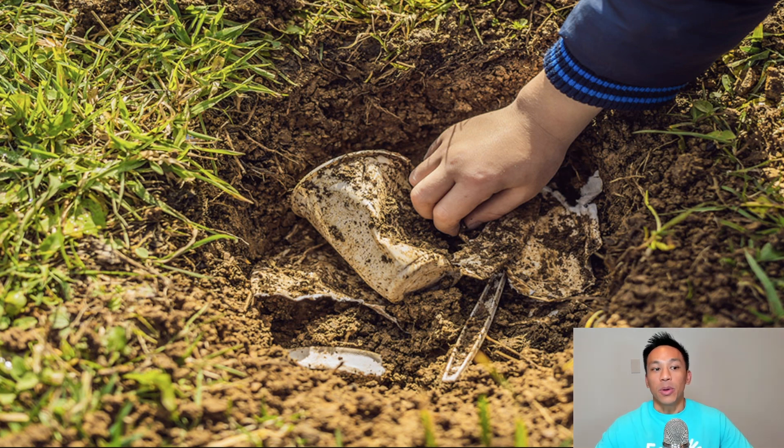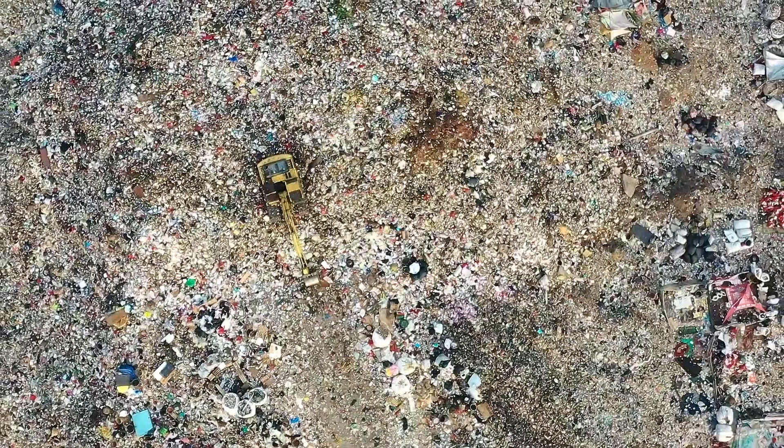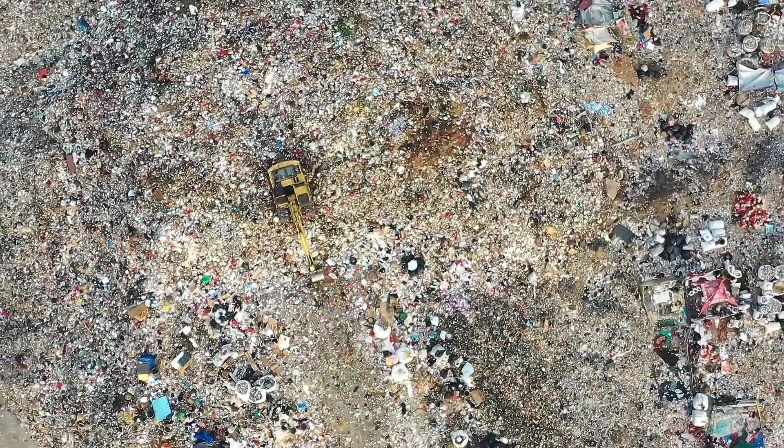EcoGloves has come up with innovative technology that allows these disposable gloves to break down in landfills. This is biodegradable technology, not to be confused with compostable disposable gloves, which we'll have a different video for as well.